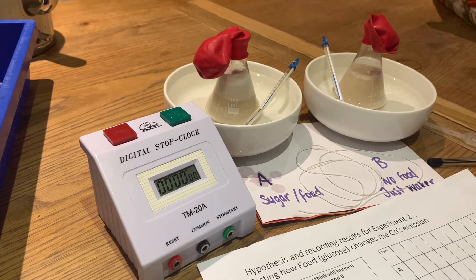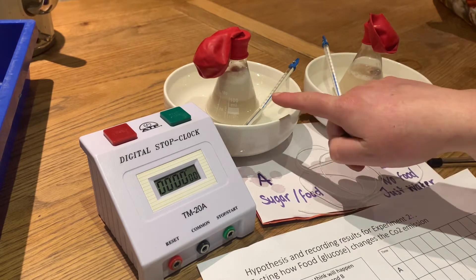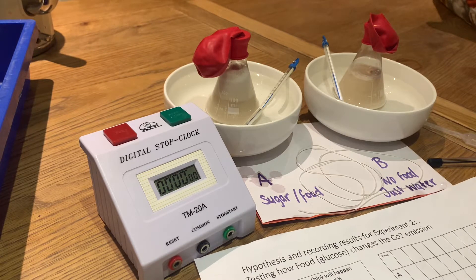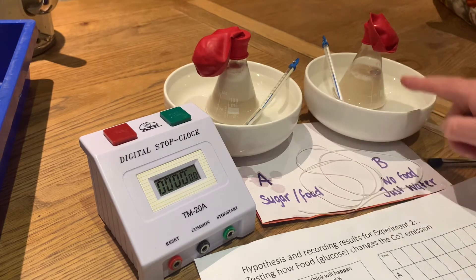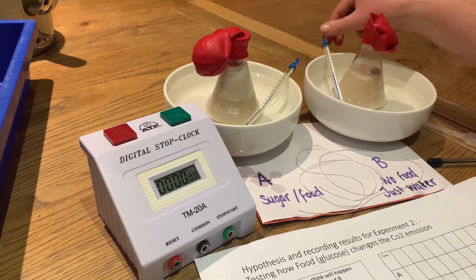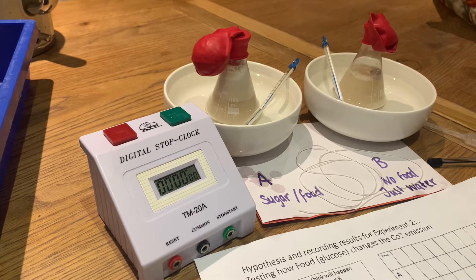I want to find out if yeast needs food in order to produce CO2. In conical flask A, I have added glucose sugar, and in conical flask B, I've added just water. The water inside each flask is 36 degrees, which I'm checking on the thermometer, and I've surrounded them with water that is also 36 degrees to sustain that temperature.